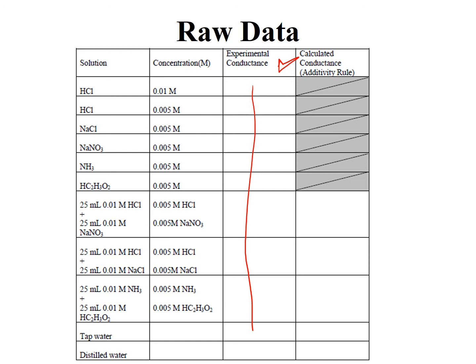You're going to do some calculations: based on the experimental conductance of the individual solutions, when you mix them, what would be the calculated conductance, and compare it with the given experimental conductance. You're going to submit this, the graph for the 3 plots, and the answers to the questions. The answers to the questions are mostly just C1V1 equals C2V2 problems that we have discussed during chapter 4.